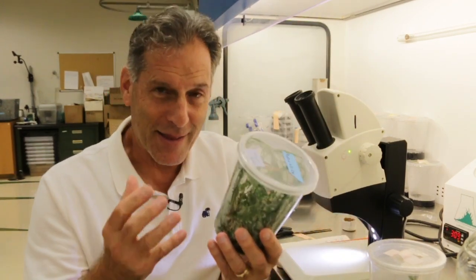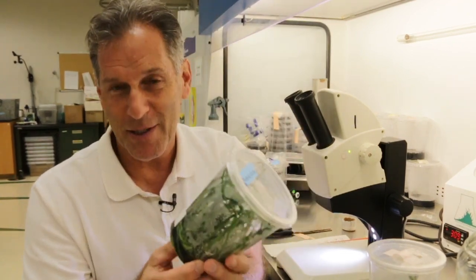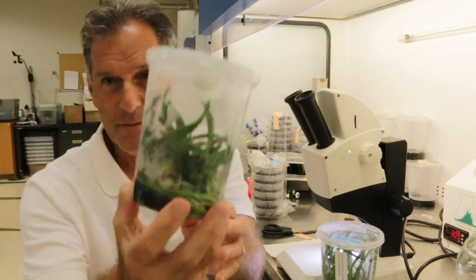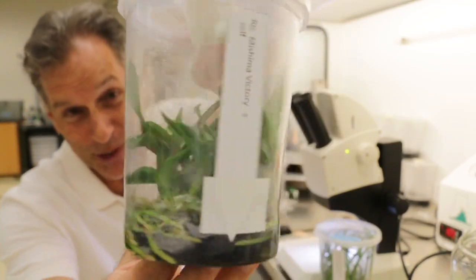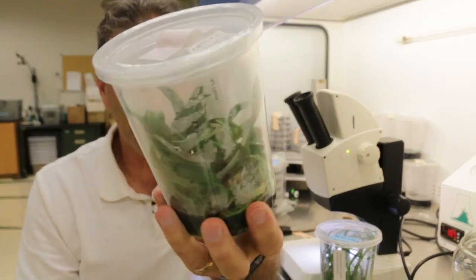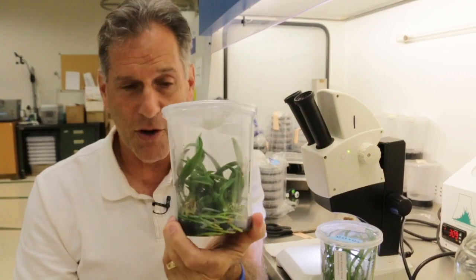Orchids have to reach a certain size in order to flower, and if you get them big here I think it gives them a jump on things. This is one of my other cattleya flasks, and these are also pretty big. This is a shelf of Mishima Victory, which is one of my favorites and it's a fairly large orchid, but these are growing so quickly here.